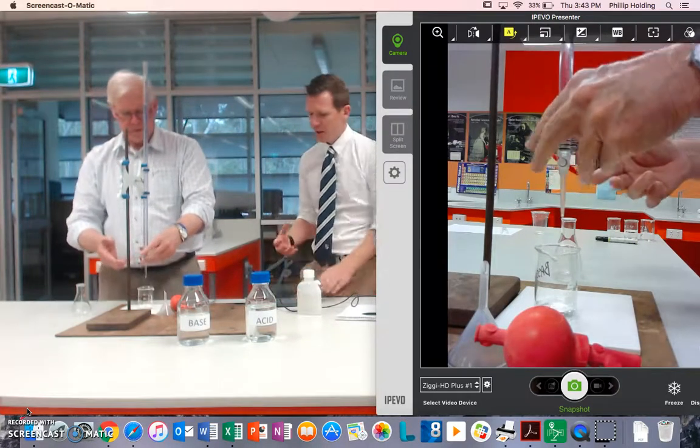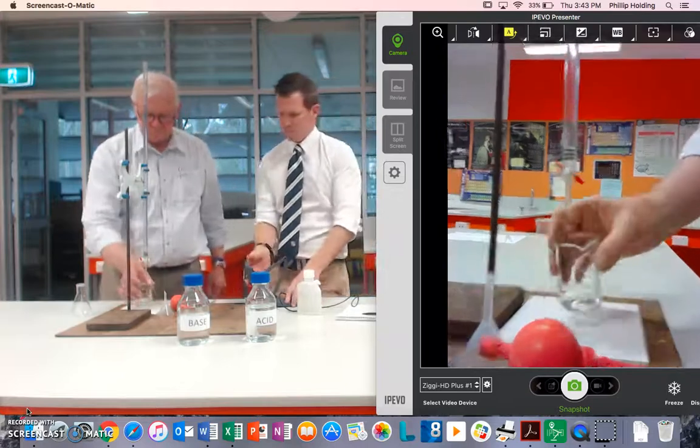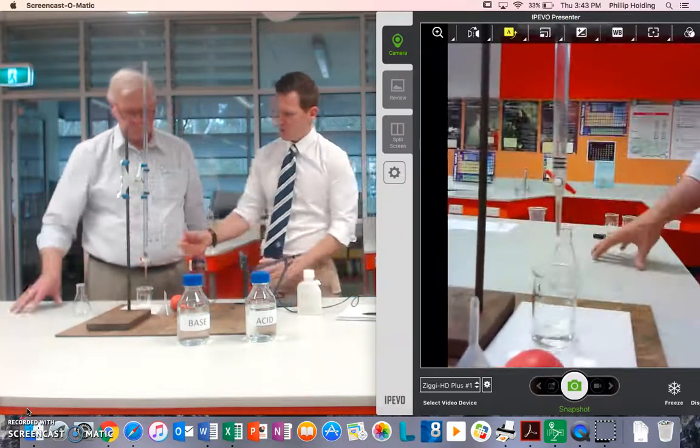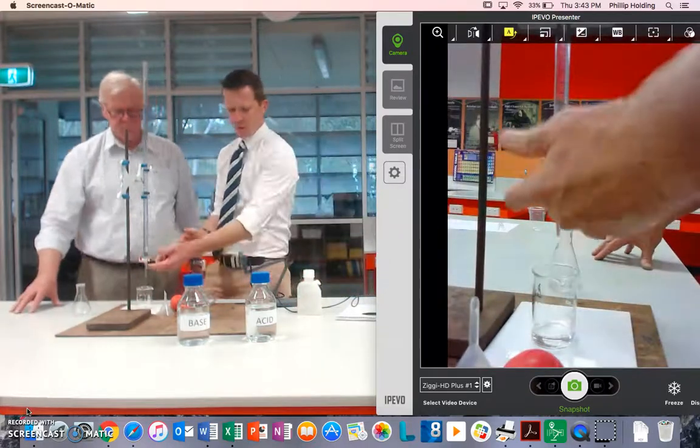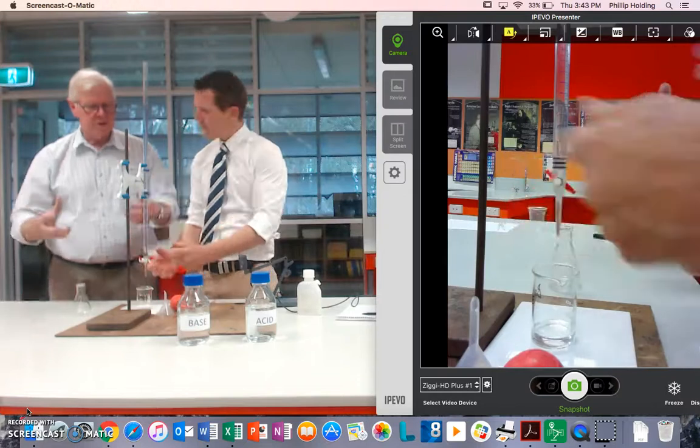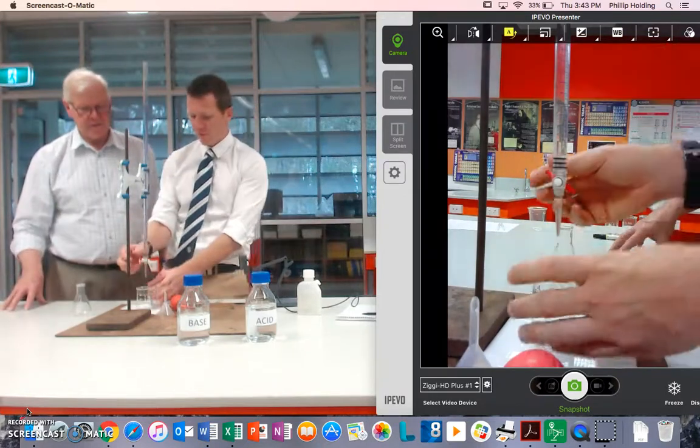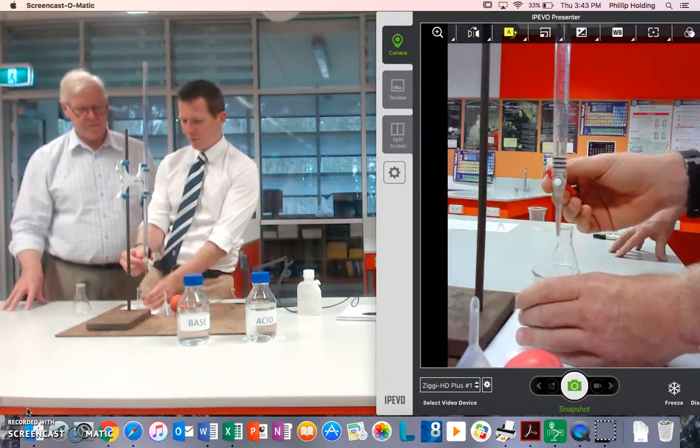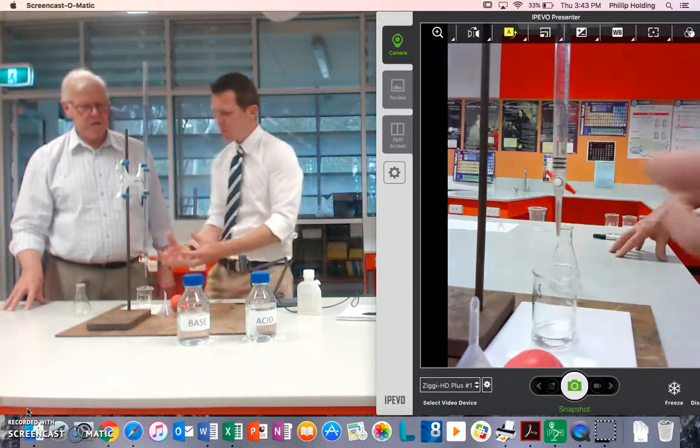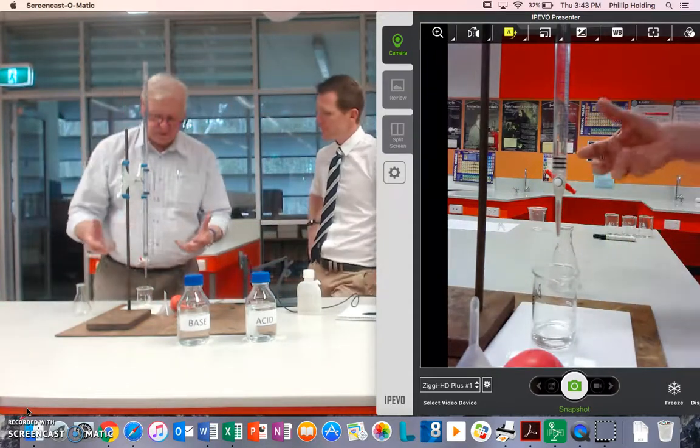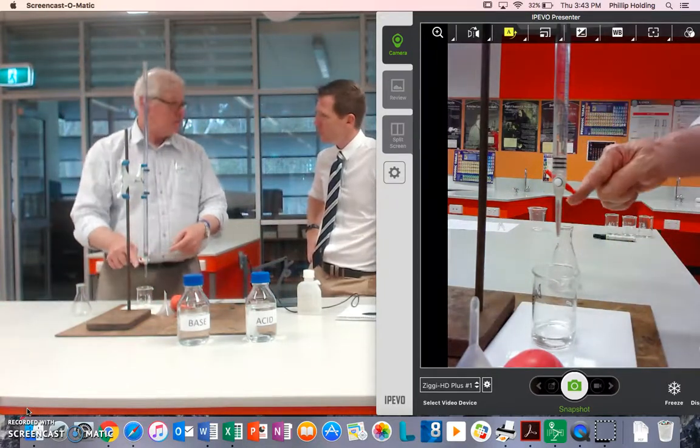So when you do that, out of interest, I've sort of used it. I notice you use it left-handed that way. I'm right-handed, so I use my left hand. So you do. So I've always done it that way. So what was the reason?